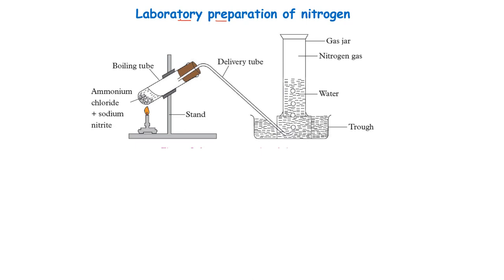We have a simple setup, at least it must be familiar to most of you, basically having simple equipment whereby we shall collect our nitrogen over water.